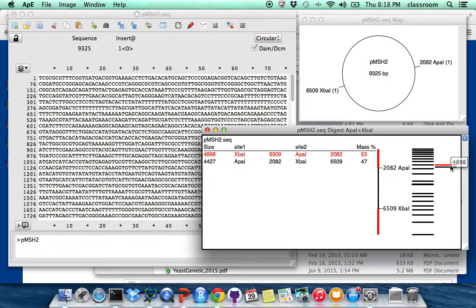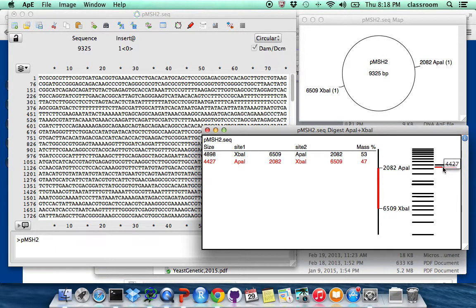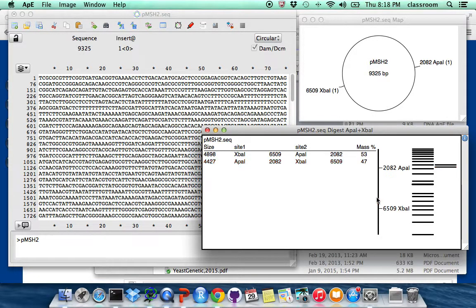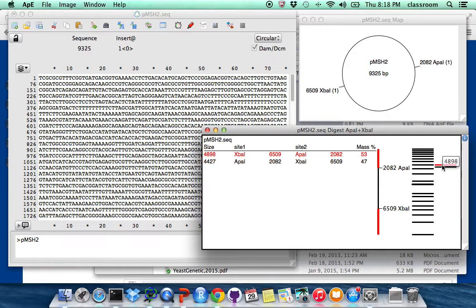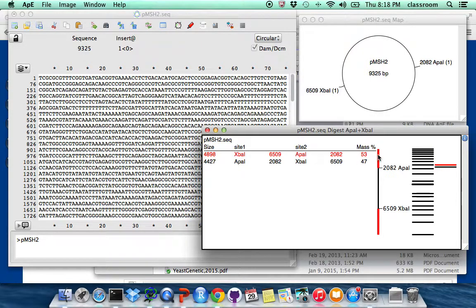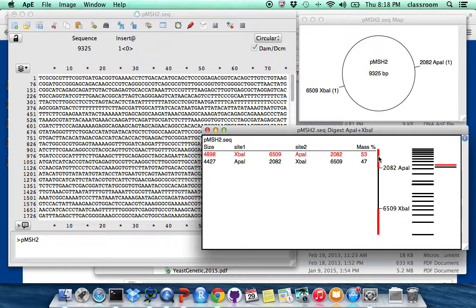One is 4427. This is 4427, the lower one is also the middle fragment between API1 cut and XBI1 cut. The top one is 4898 base pair, that's this fragment. Then on the plasmid is this one. It was the blue fragment in my PowerPoint demonstration.